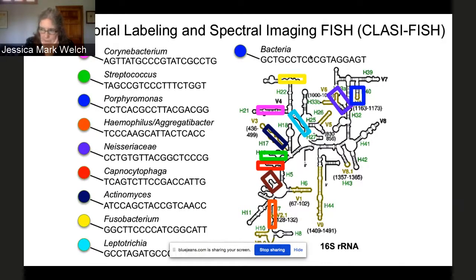We did that especially when we were first doing this because, in principle, if you have overlapping bacteria in a densely populated biofilm, any particular pixel can have light entering the pixel in your camera from more than one bacterial cell because of the depth of the biofilm and the overlapping.